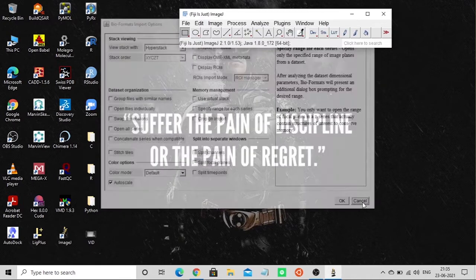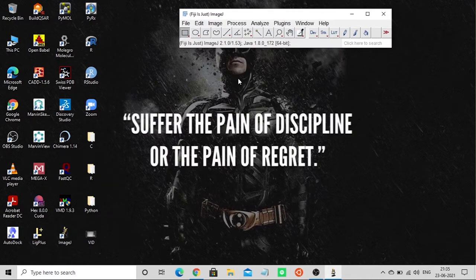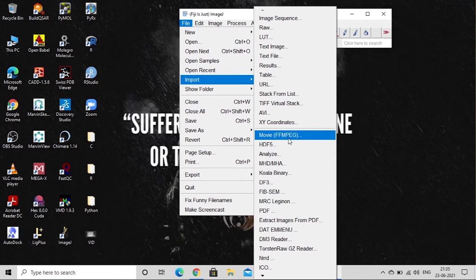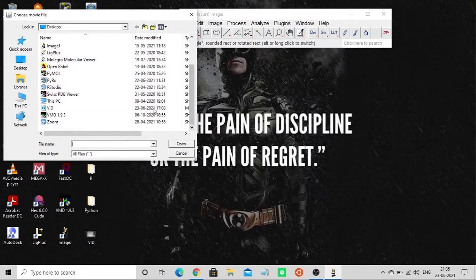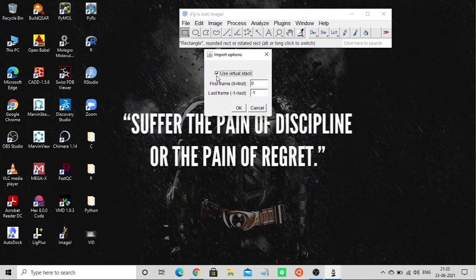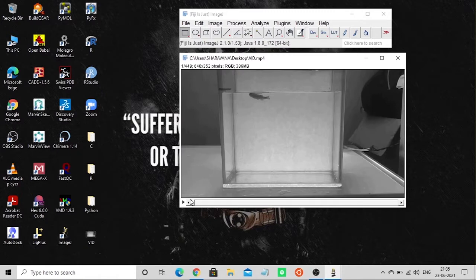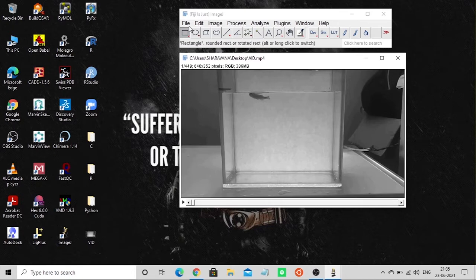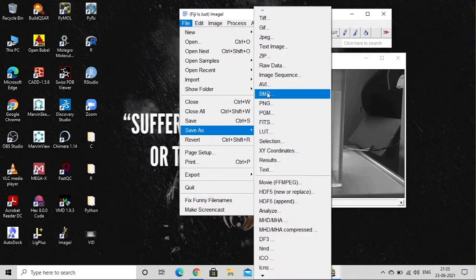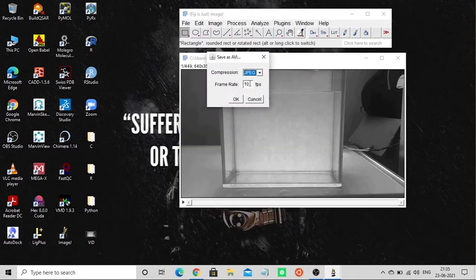There are two ways to handle this. You can use a plugin called 'Movie FMpeg' — there are videos explaining how to install it — to import the MP4 file. Alternatively, you can convert the MP4 format to AVI within Fiji, which makes it easier to open and work with. The MP4 file is loaded here, and now we'll convert it.